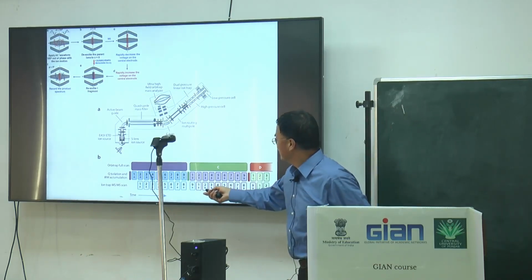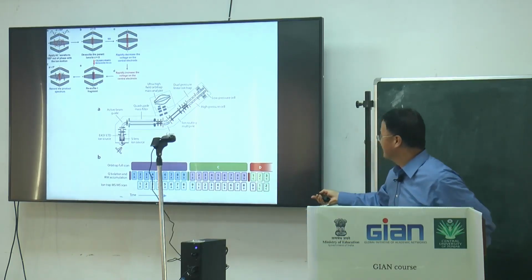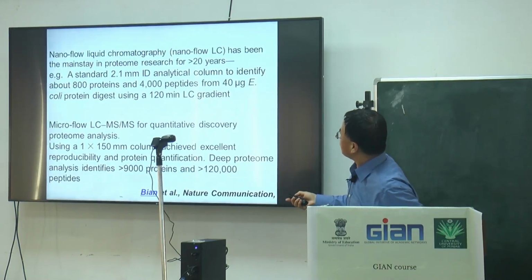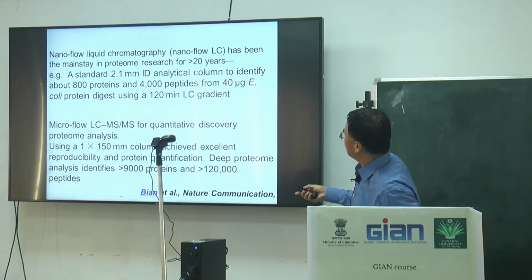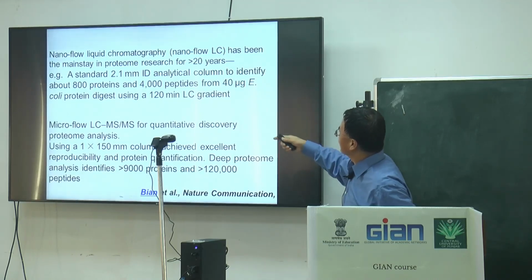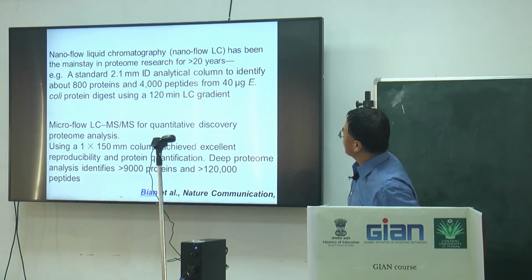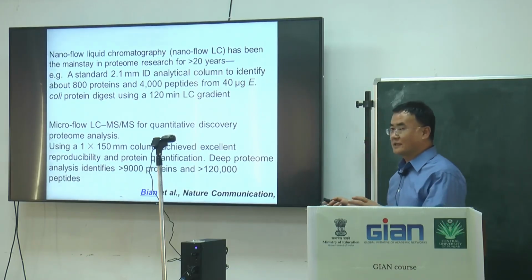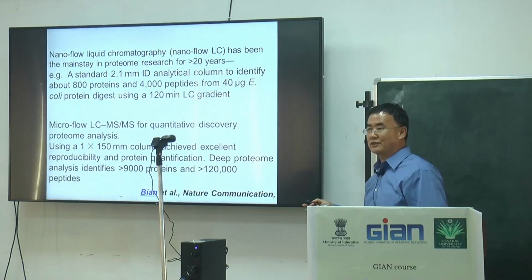Finally, we get the ion trap mass scanning, which gets the data. This is another newly developed method; I just read the paper. It gives very good isolation for the peptide, with nanoflow liquid chromatography. Yes, this is a different type of LC-MS/MS. This mass analyzer can also get very good isolation of digested total protein for proteomic study.